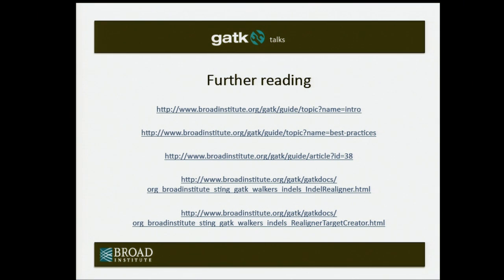Is there any reason to go back to unmapped reads and try to realign them using this, or is it possible to do that? So the question was, is there any reason to go back to the unmapped reads?